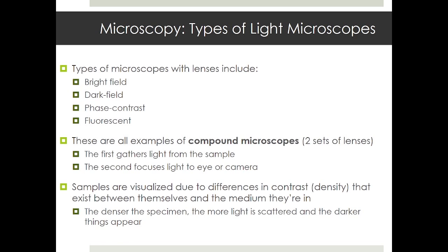There's a very delicate balance, and oftentimes when you're preparing, for example, tissue samples and things of that nature, you actually have a machine that will cut your tissue at very specific thickness so that when you mount it on a slide, it is penetrable by light and you can see through it. It's very hard, and I'm sure if you've ever cut, for example, salami or cheese or something by hand and you're trying to consistently cut those things to the same width all the time, it's virtually impossible. So we do have ways around that with different types of machines that allow us to very specifically cut the same size of tissue every time for microscopy.